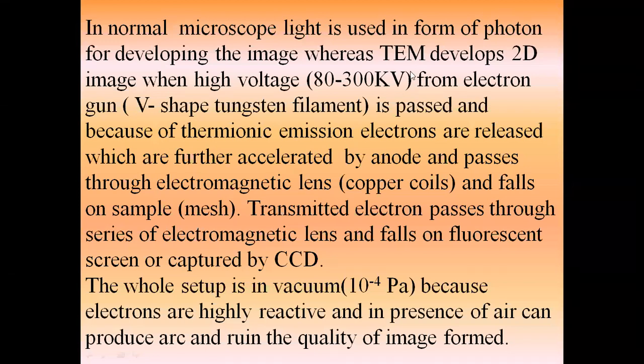In TEM, we get a 2D image when high voltage, 80 to 300 kilovolt, from the electron gun is exposed.